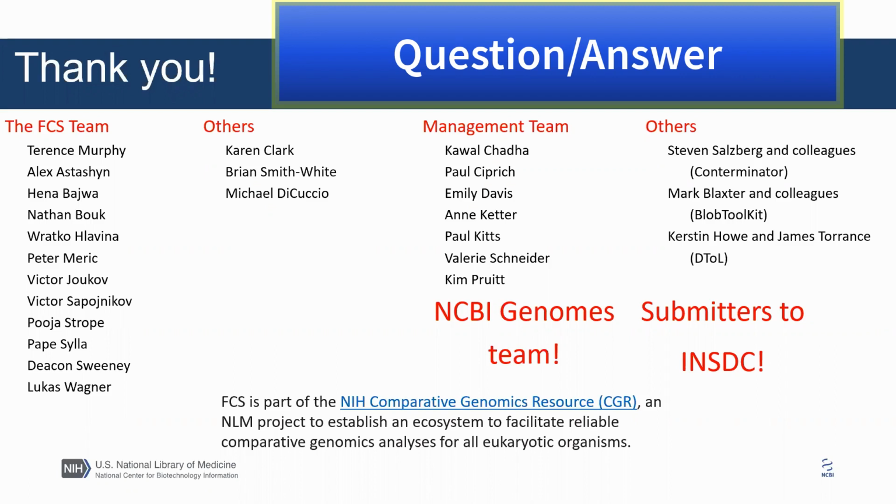This is a content piece that we're currently working on, but from a biological perspective, it's very interesting. Cool, thank you. This next question is from me, basically. When I run BLAST, a lot of times I can easily identify contaminants that are present in genome sequences. Is there an effort to go back and look at things from before we had this tool, going back into the archive and trying to find more contamination?